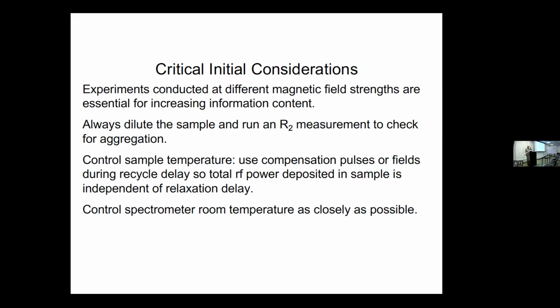best we can do. The other thing, modern Bruker spectrometers come with what's called a T-lock. So you can add a compound, usually a compound containing a temperature stable methyl group. And then during the experiment, the spectrometer is constantly adjusting the VT air to keep the splitting between the water line and that methyl group constant.